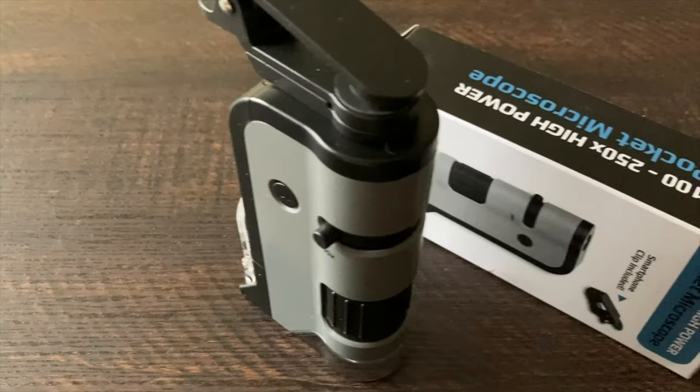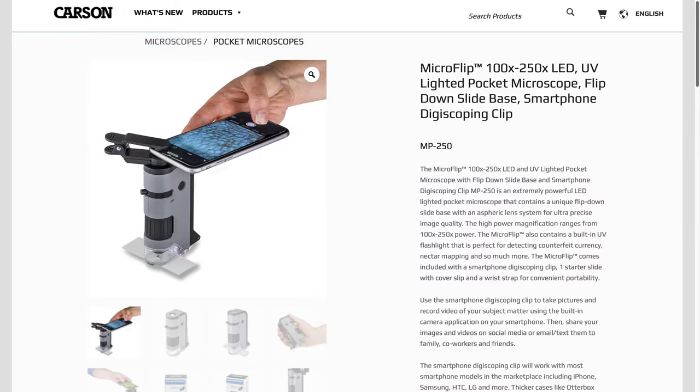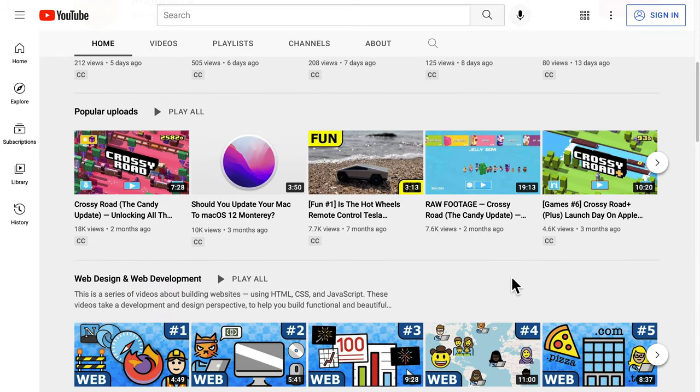I got this pocket microscope to help with a photography project I've been working on. Unfortunately, it didn't turn out as planned. Yet the Carson MP250 was a fun gadget, so that qualifies as a video in the Photics TV fun playlist.